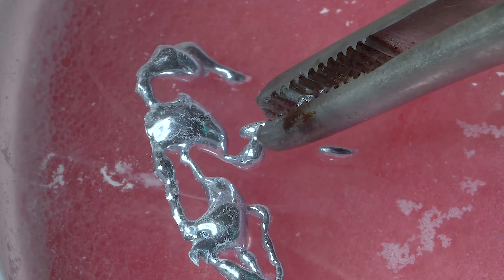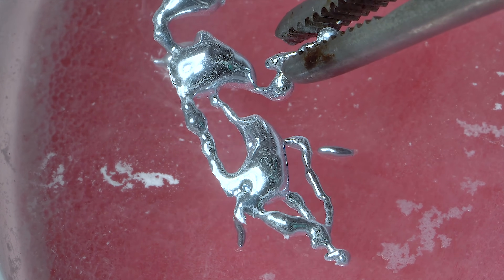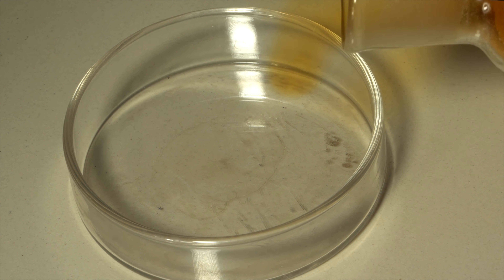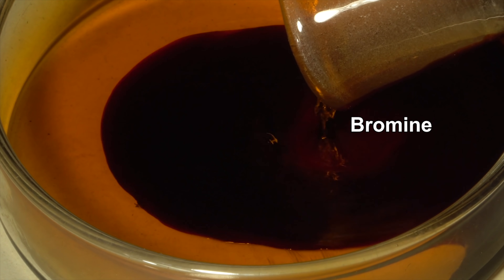All of the processes we've been observing so far were more physical rather than chemical, so it's time to move on to chemistry. I'm filling a petri dish with bromine and adding a little bit of liquid gallium from the syringe in it.